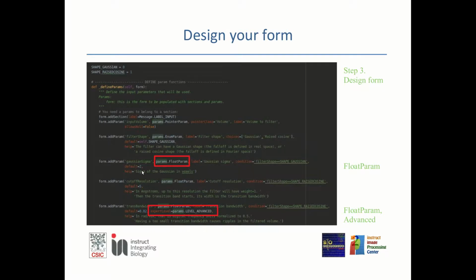And you can also even define default parameters. So if you don't give a default, it is empty, and then it is requested from the user. The user is forced to give some value there.